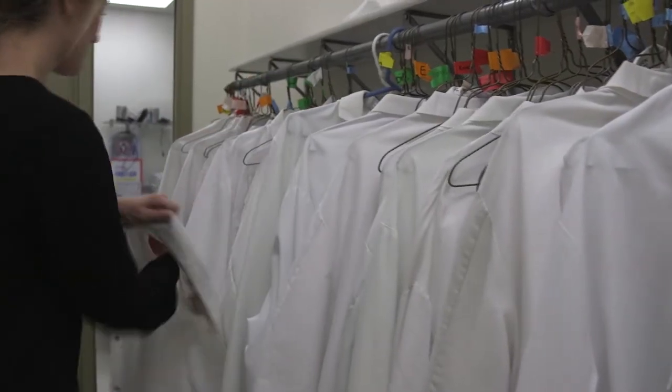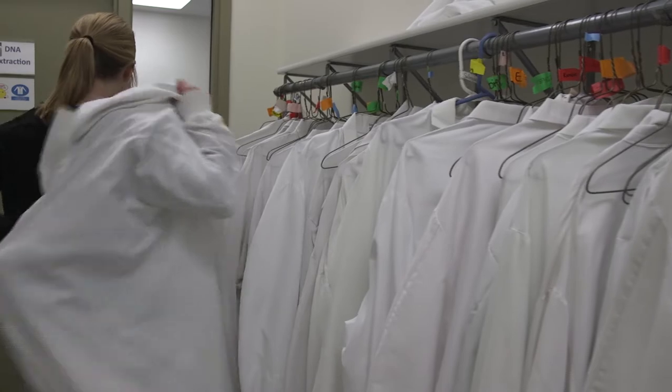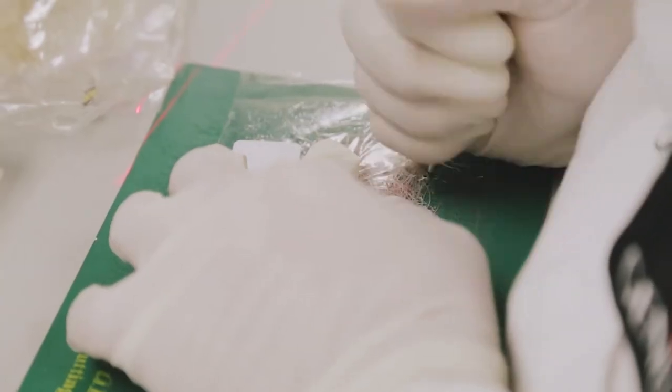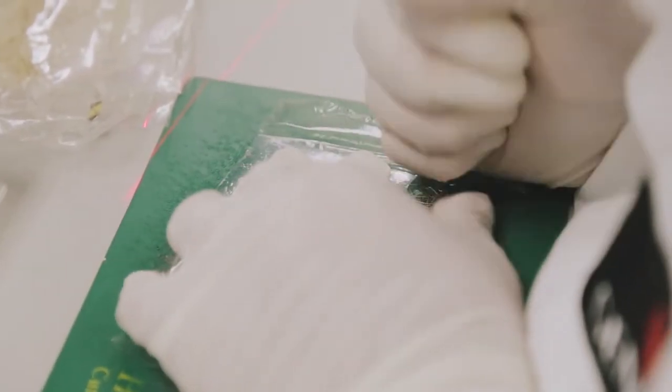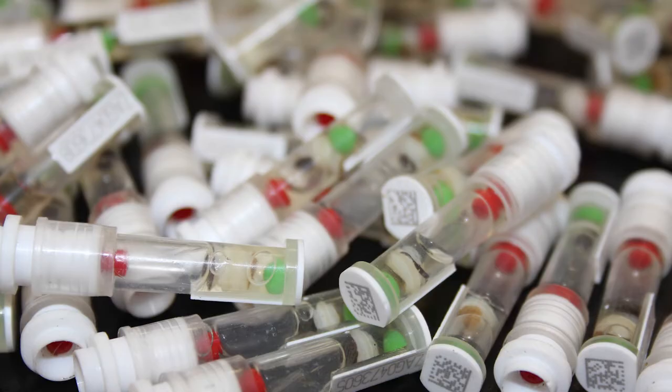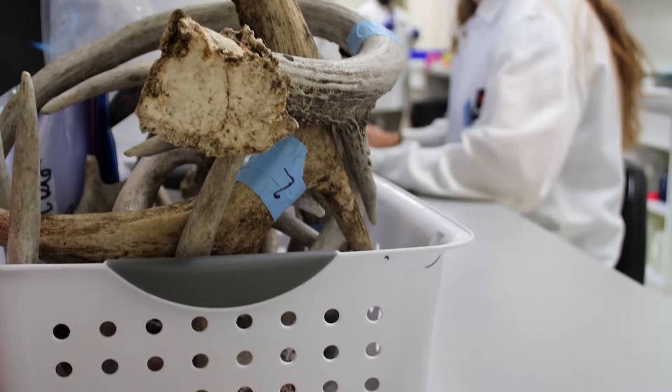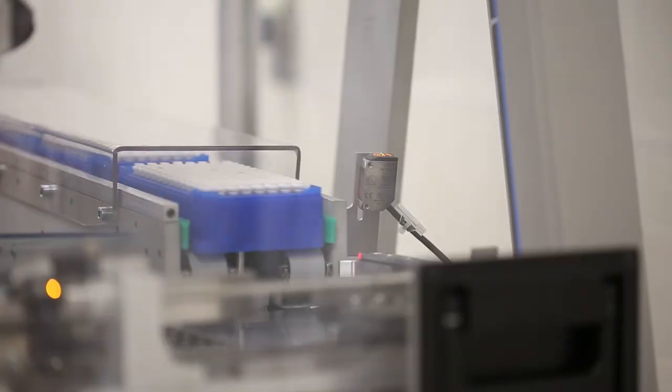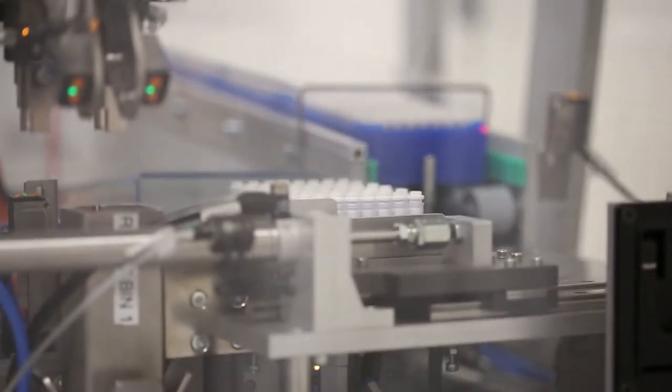The next step involves extracting molecules of DNA from various species' cells. The original sample material could be hair follicles, blood, tissue, or even unique items like deer antlers or cheek swabs from cats. In each case, the initial target units are the nucleus of the cells in the sample.